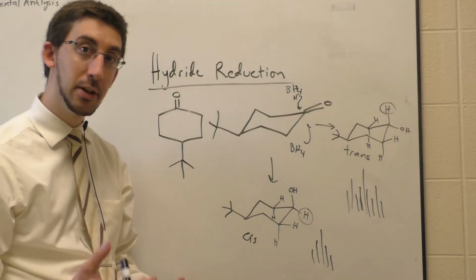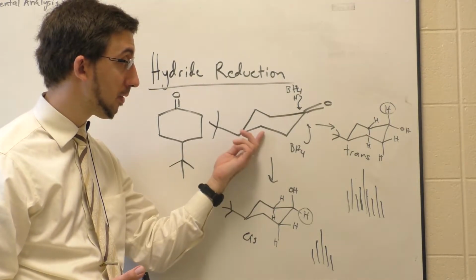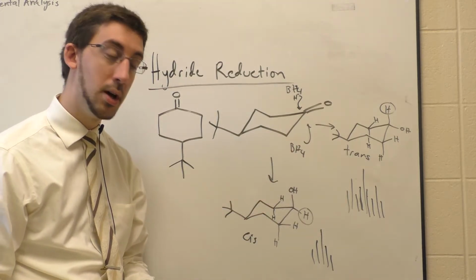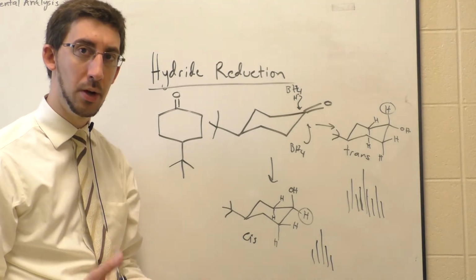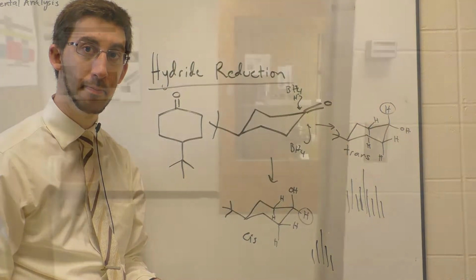And we'll take the melting point of that, since there is a difference between the melting point of the starting material and the melting point of the two alcohols. And then really we'll characterize the product distribution by proton NMR. So let's head up to lab and get started.